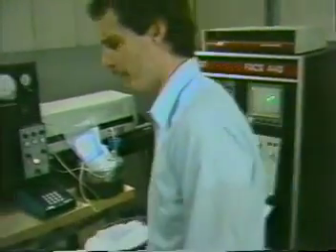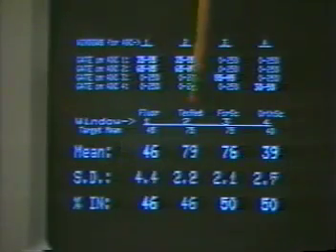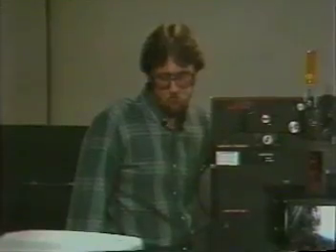How are things coming here, Keith? I think I just about have it aligned. I just need to focus a little bit on the fluorescence channel. Yeah, I see you got it tuned up pretty well. That's about it. Now we need to bring it up with the PMT voltage. You want me to get it? Please.